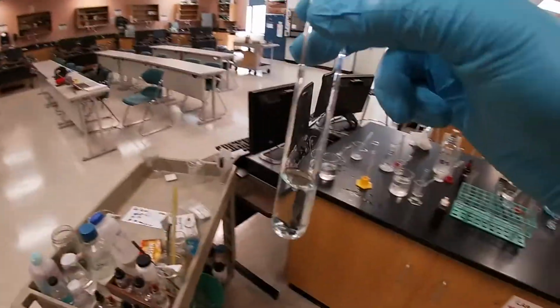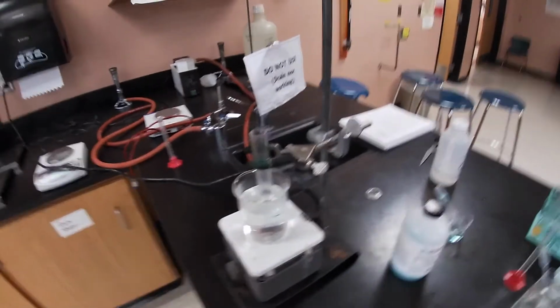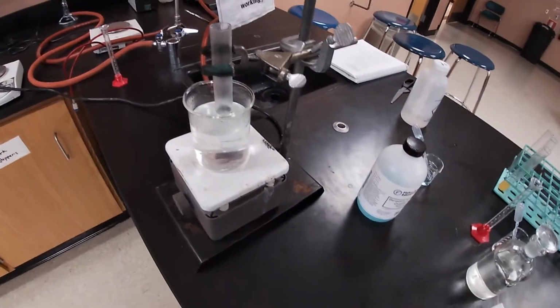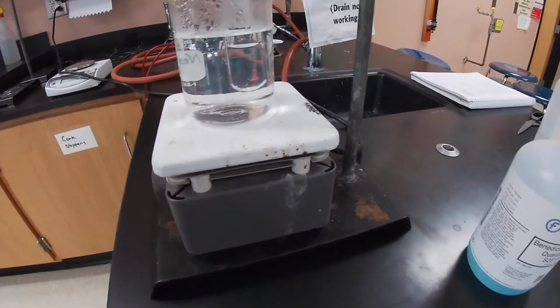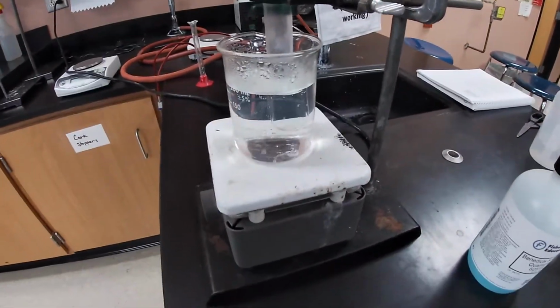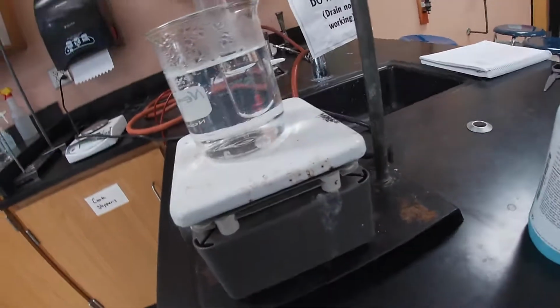So here we have our solution. The next thing we're gonna do is put it in our boiling water bath, and we're gonna heat it up for approximately 5 minutes to determine if we get that nice little yellow color that we got over here. All right, so 5 minutes, we'll come back and check it out and see what's up.